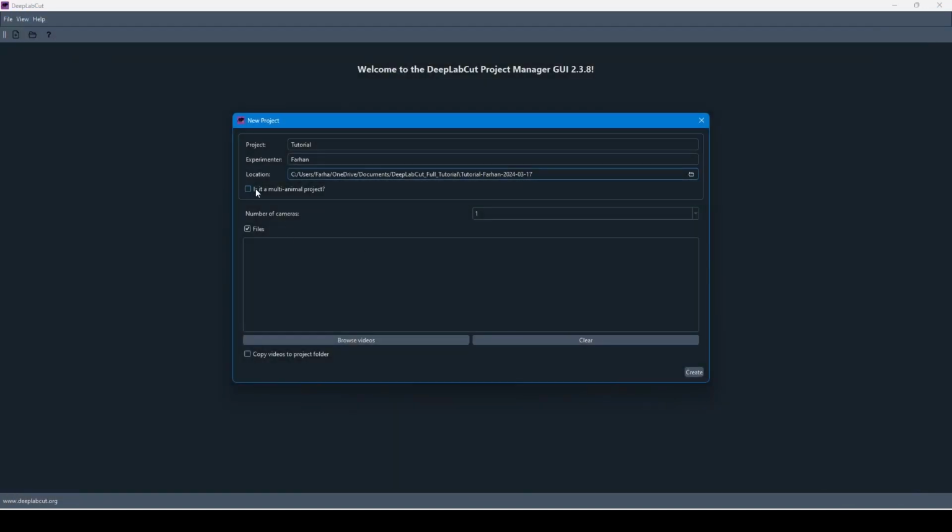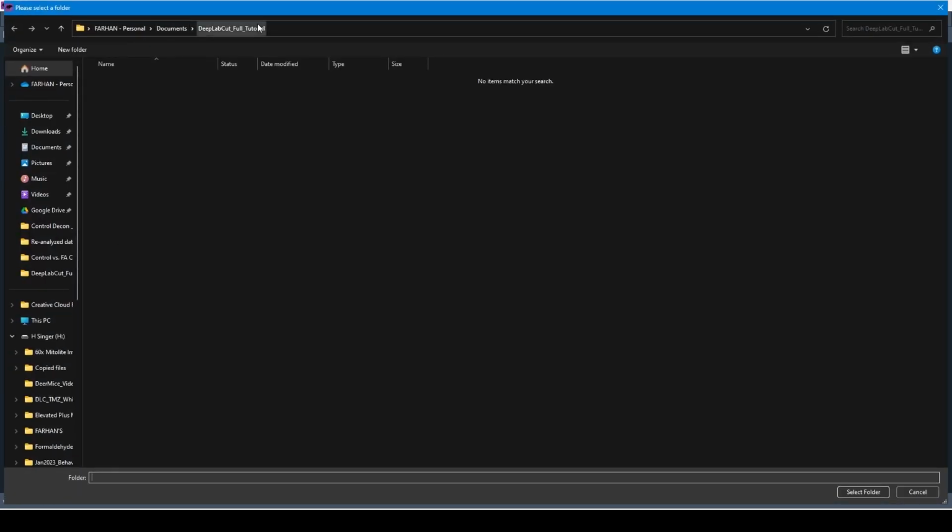This is not a multi-animal analysis, so I'm not going to check this box. In terms of the videos, I do want to copy them, and I'm going to now import the videos.